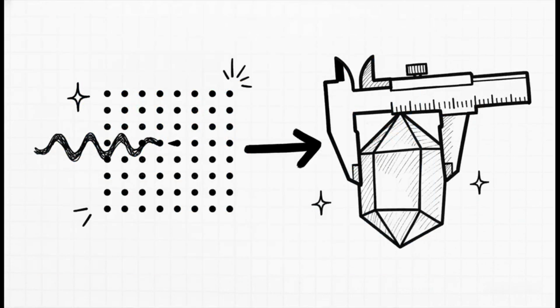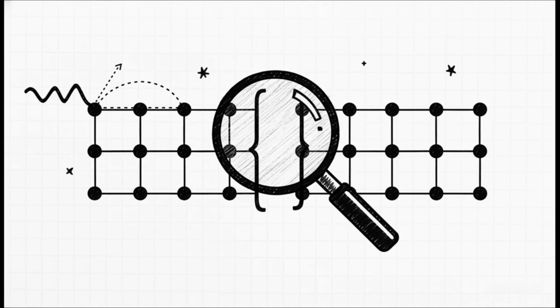And that perfect wave syncing brings us right to this mathematically elegant equation, Bragg's law. Formulated by Lawrence Bragg and his father, William Henry Bragg, this is the exact mathematical translation of the constructive interference we just talked about. Let's break down these specific variables so we know exactly what inputs we're working with here.